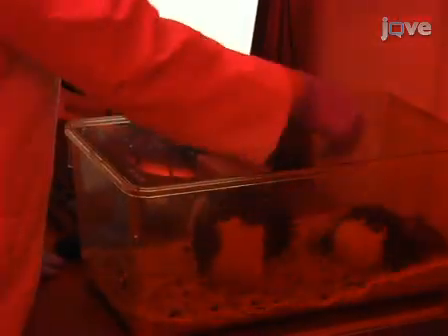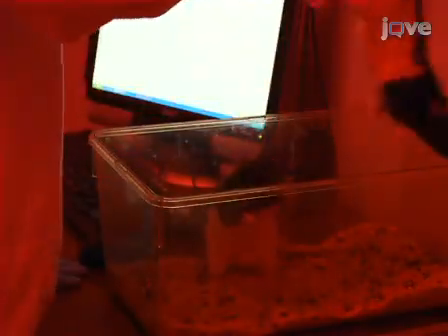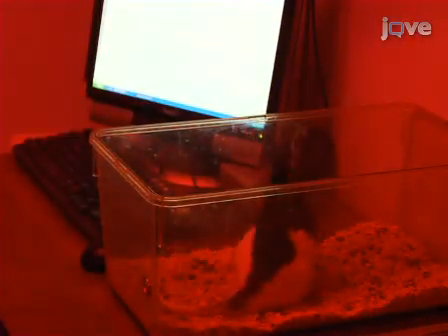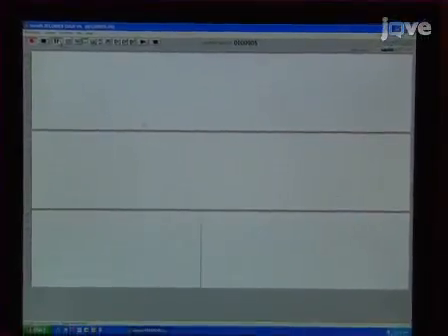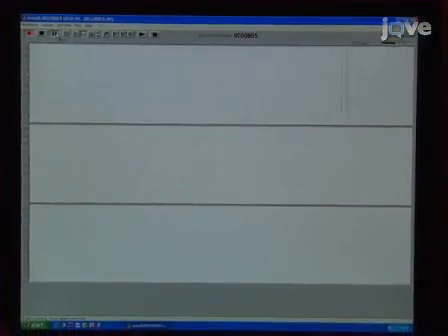When the male shows interest in the female by sniffing, chasing, or mounting her, remove the female and record the male's vocalizations for 1 to 2 minutes. Monitor the ultrasonic vocalizations visually by watching the real-time spectrogram. If the male does not vocalize immediately, briefly return the female rat to the male's home cage to stimulate vocalization.